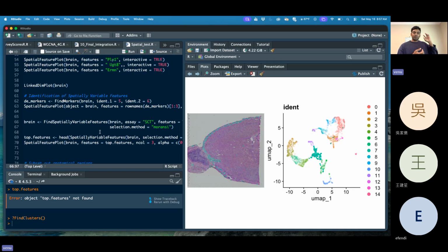First, single cell RNA sequencing has straightforward steps. We have only single cell level expression. We get all the single cells and separate them into their groups according to the marker genes. But here, the tricky part is that cells are arranged in each spot. So first we identify similar spots, and second, what kind of cells, or proportion of cells, are present within that spot, that region.